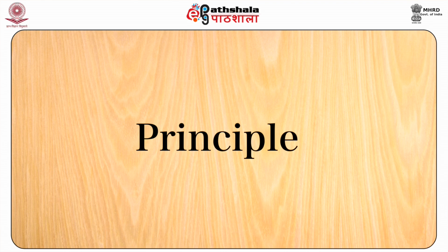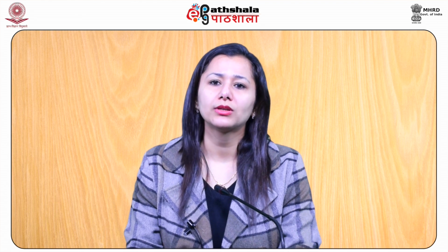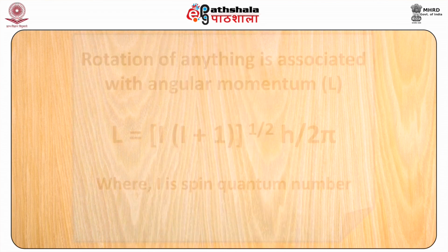Now, we shall have a look at the principle. Nucleus contains protons and neutrons. A proton carries a positive charge while a neutron is an uncharged entity. Both these particles spin around their axis with spin quantum number half.